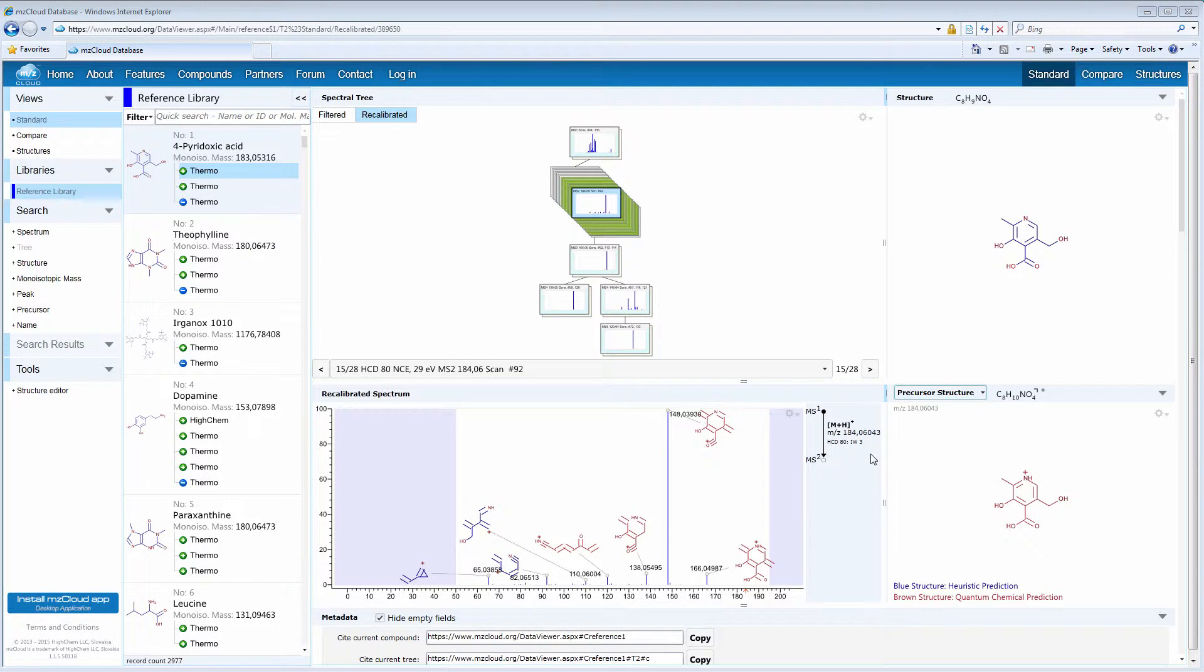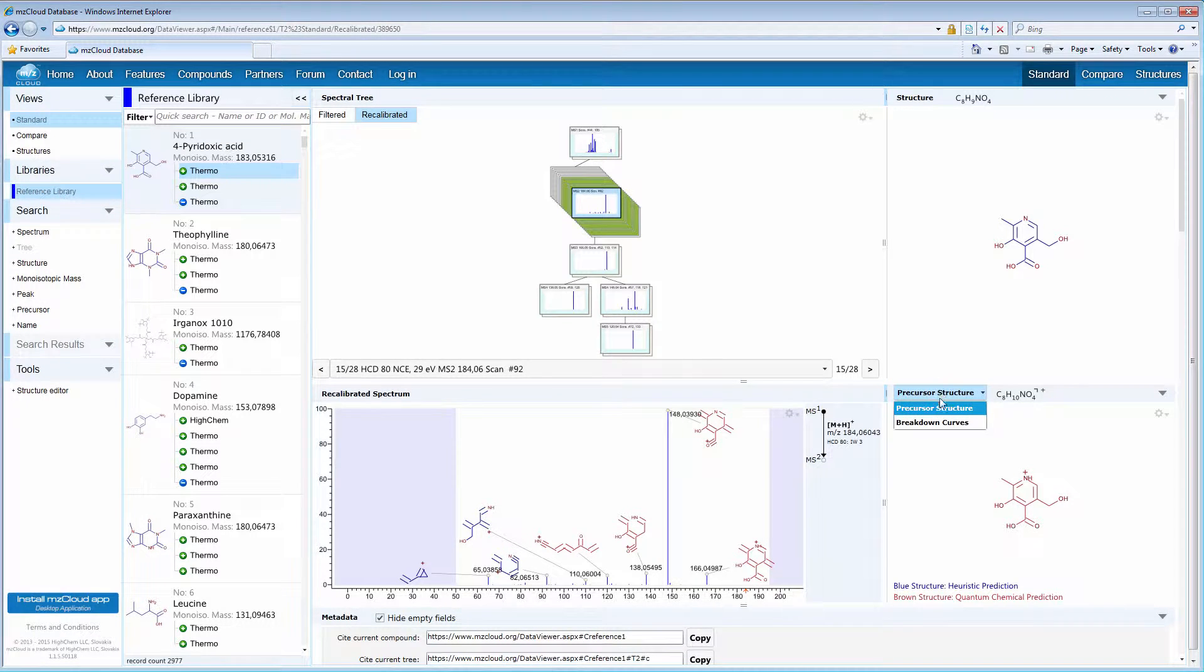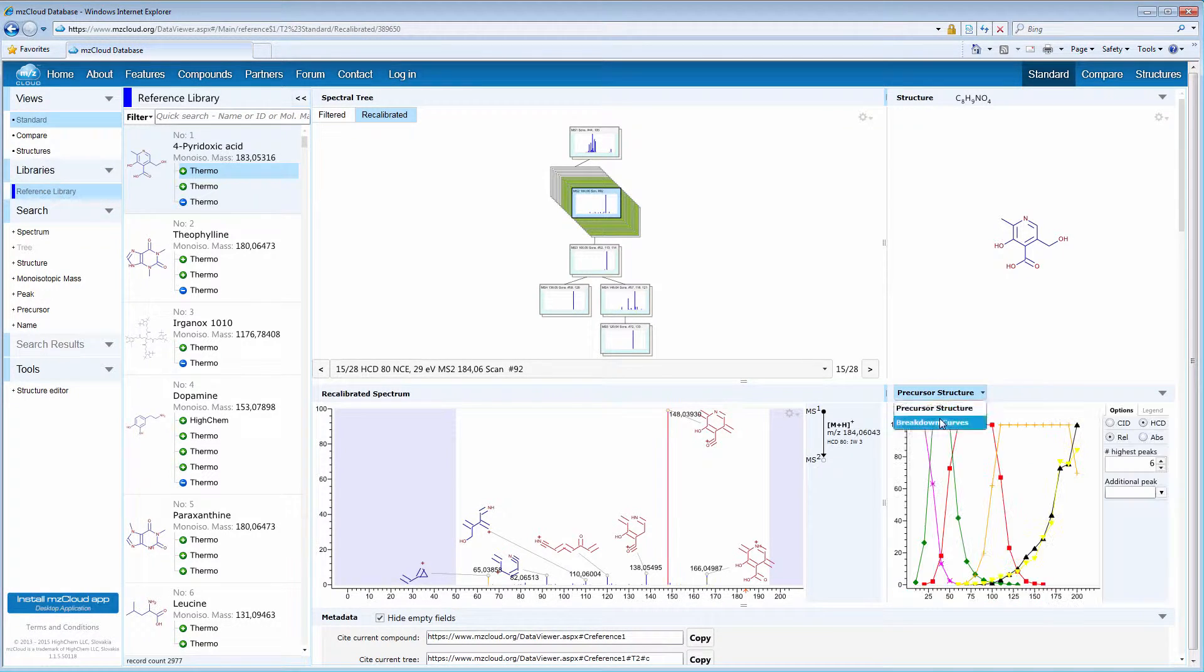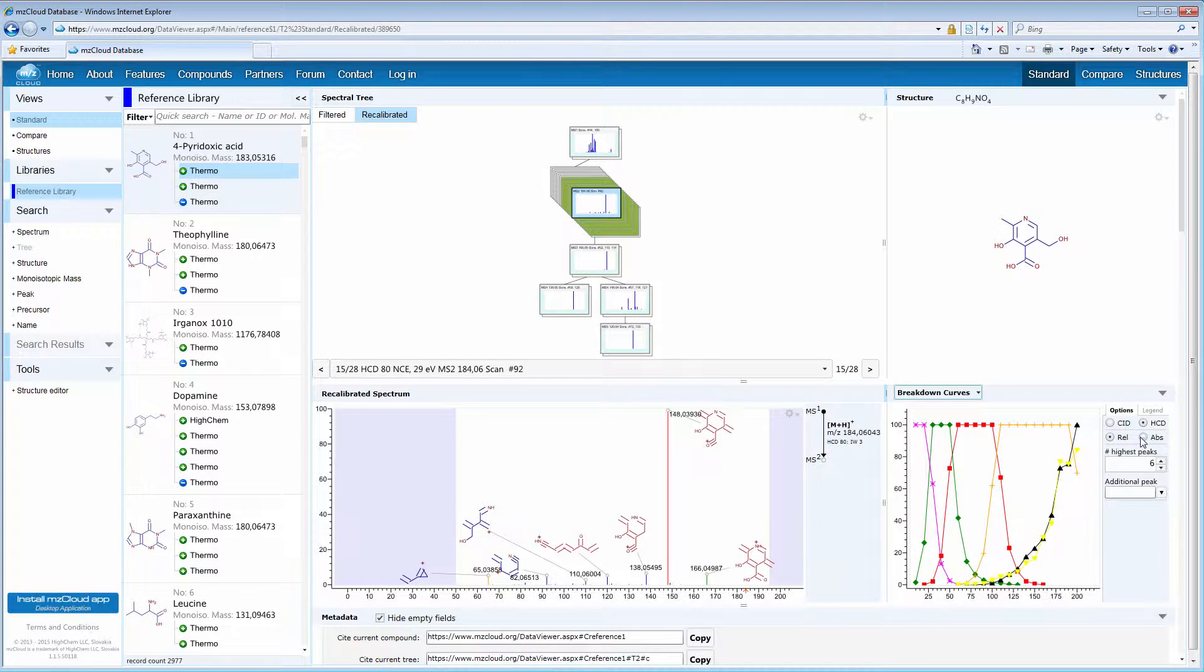If you ever wondered how the peak intensities change throughout the collision energy range, MZCloud allows you to display breakdown curves. You can change the relative intensity values to the absolute intensities.